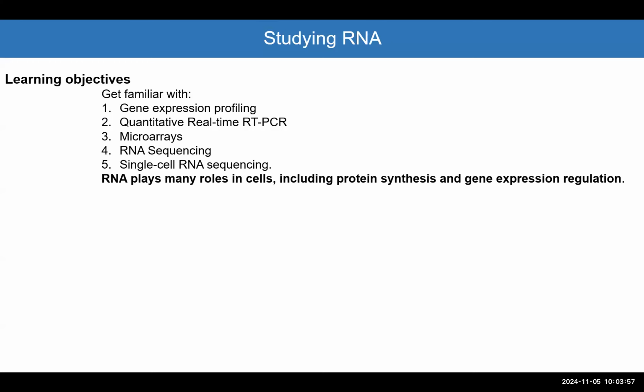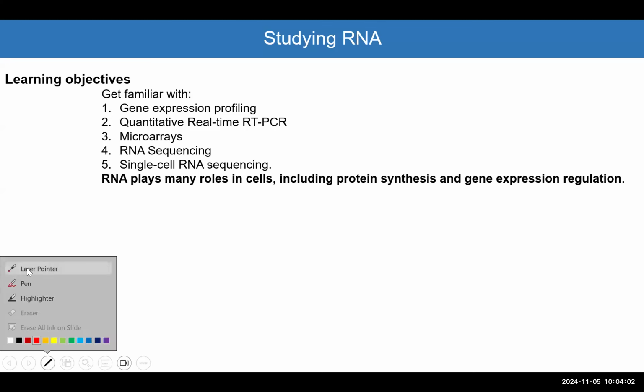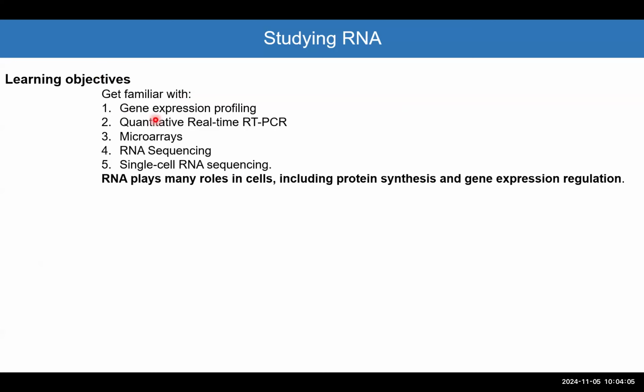So in this lecture and in the next lecture, we will discuss how we use techniques in studying the RNA. Particularly, the most interesting and the most widely used is the gene expression profiling. Probably within this lecture, I have to go very slowly on the concepts so that you know the gene expression profiling and the quantitative real-time PCR or qPCR.